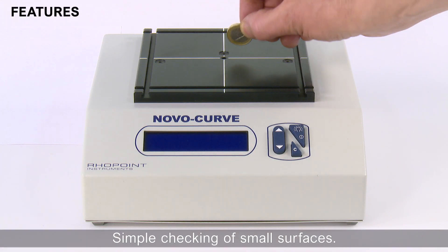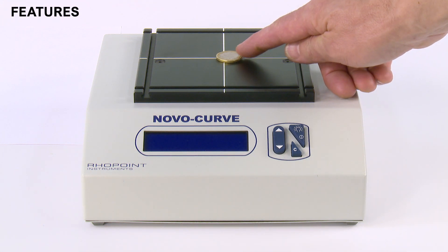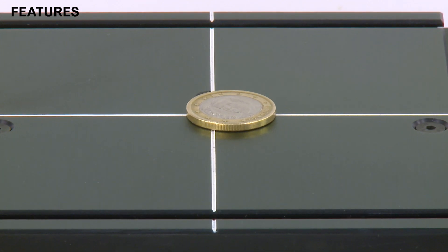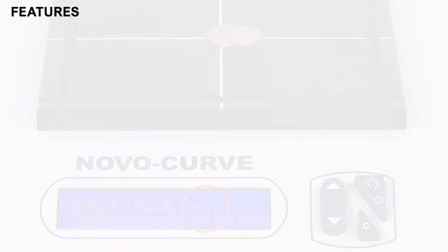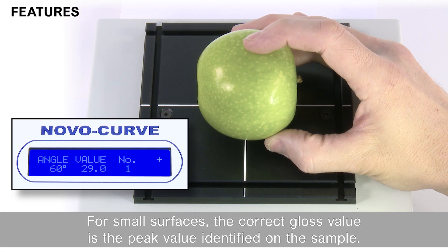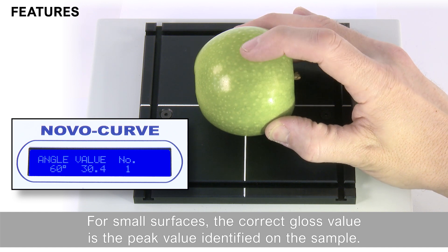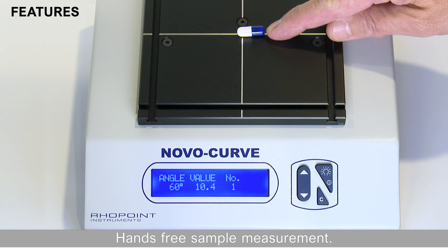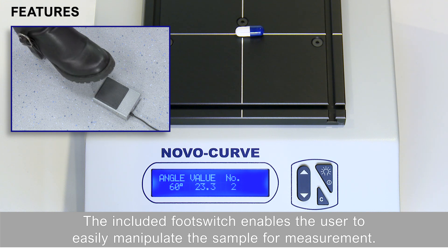Features. Simple checking of small surfaces. For small surfaces, the correct gloss value is the peak value identified on the sample. Hands-free sample measurement: the included foot switch enables the user to easily manipulate the sample for measurement.